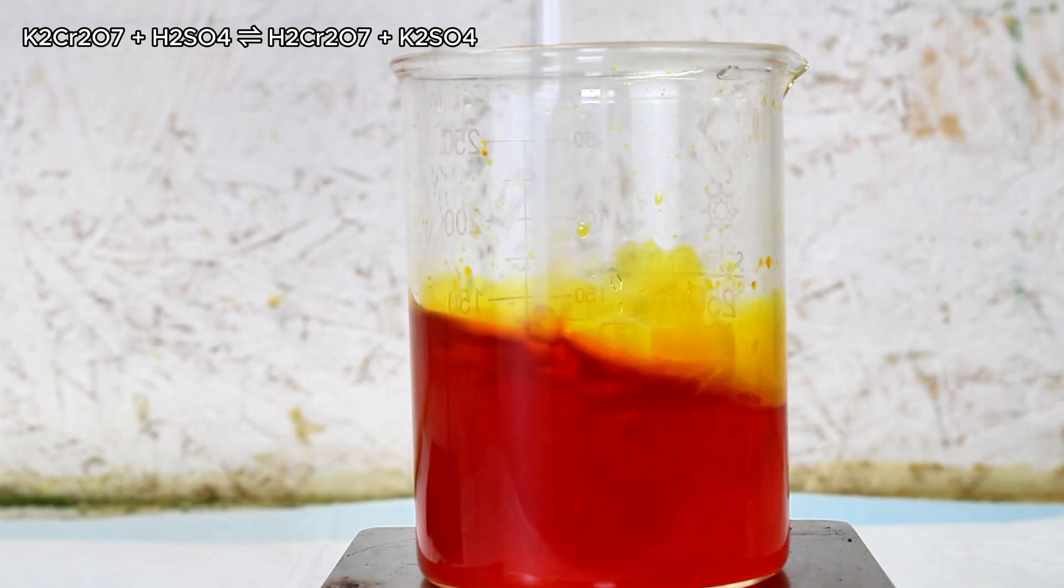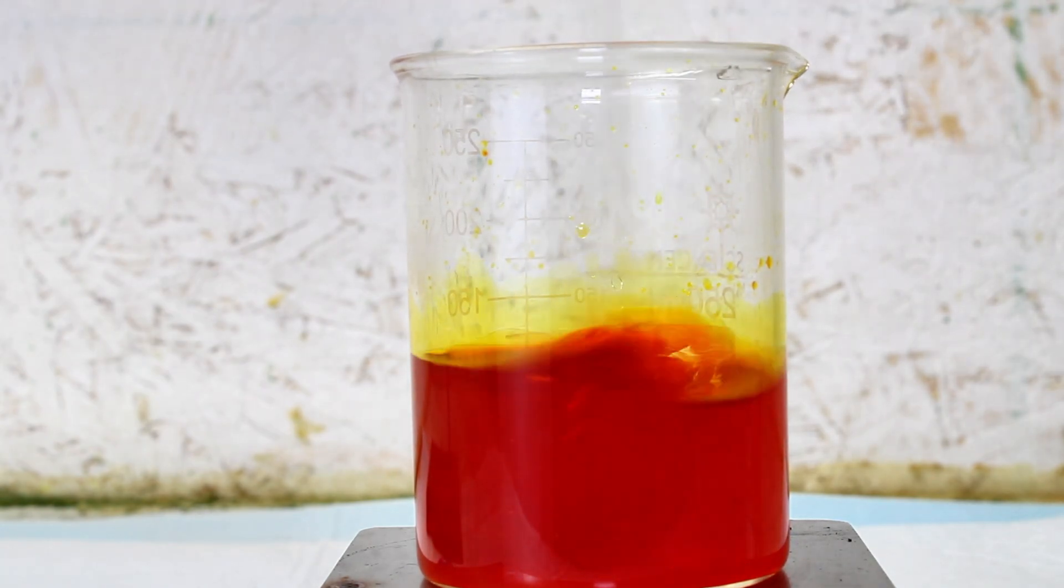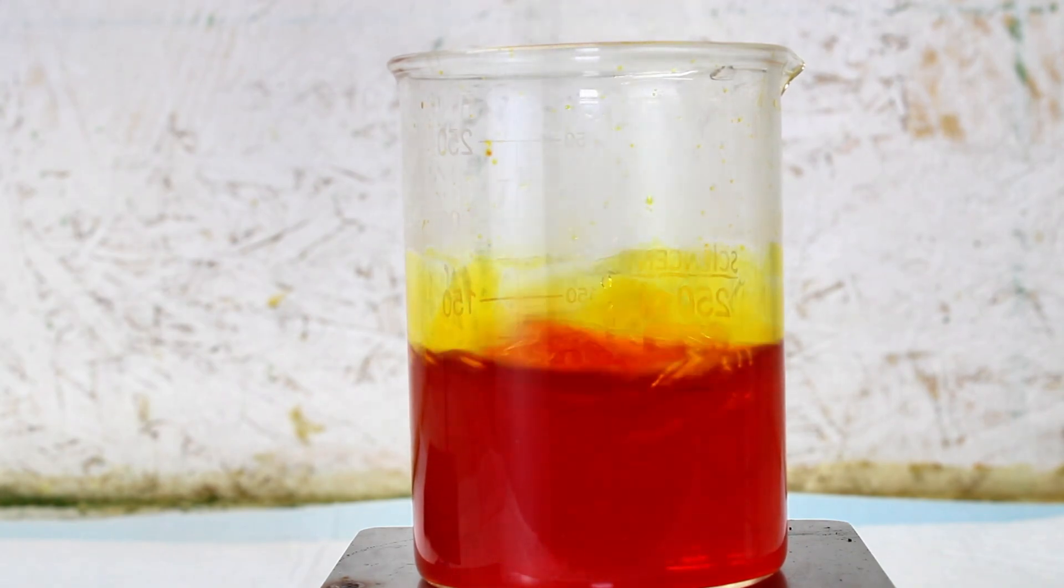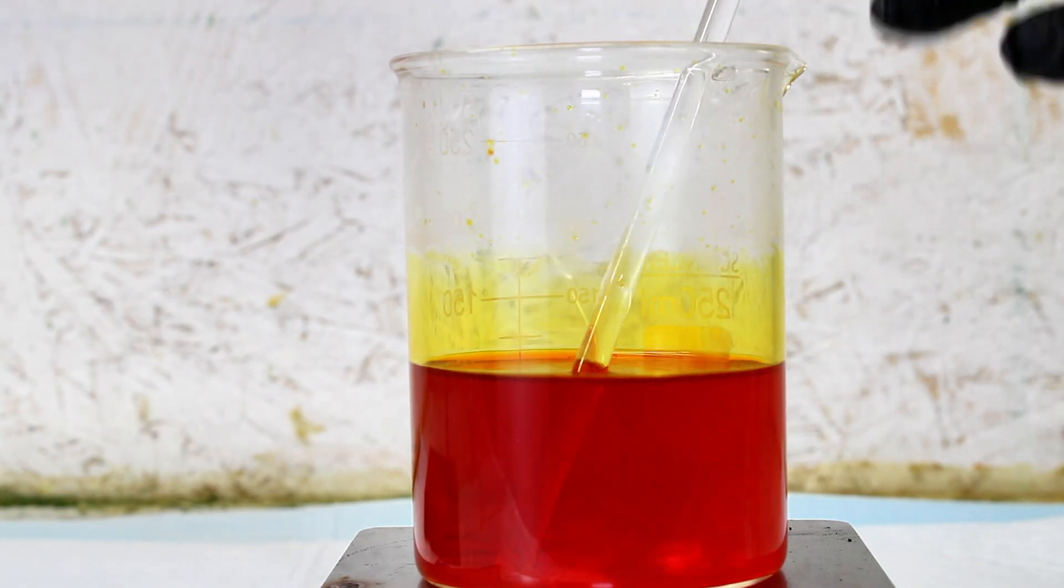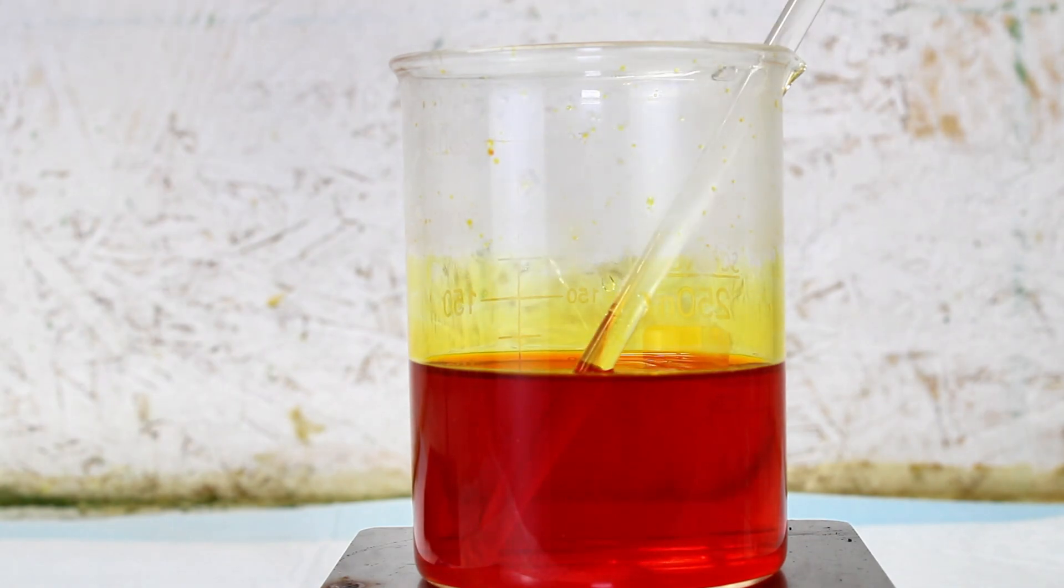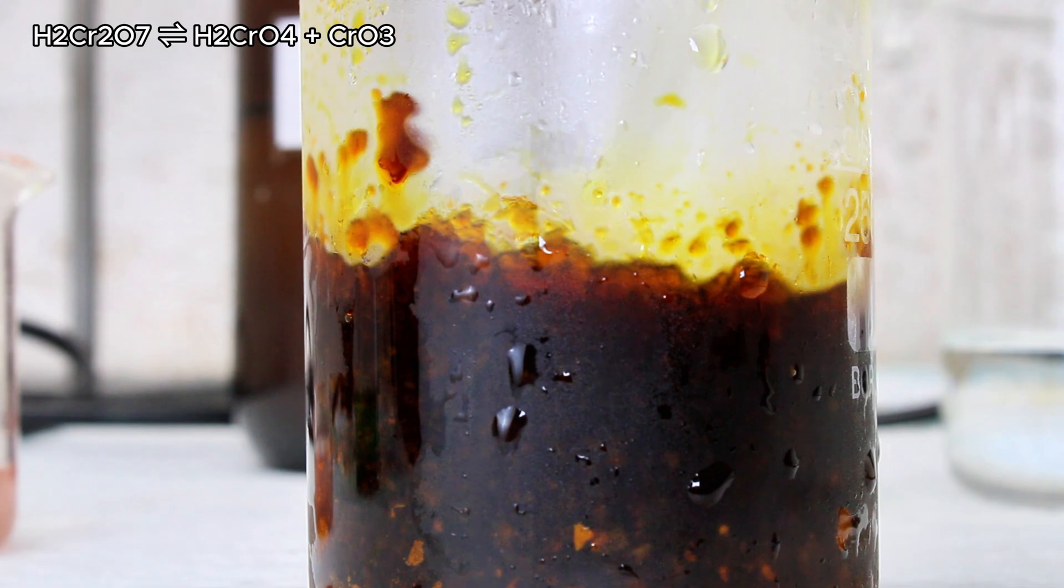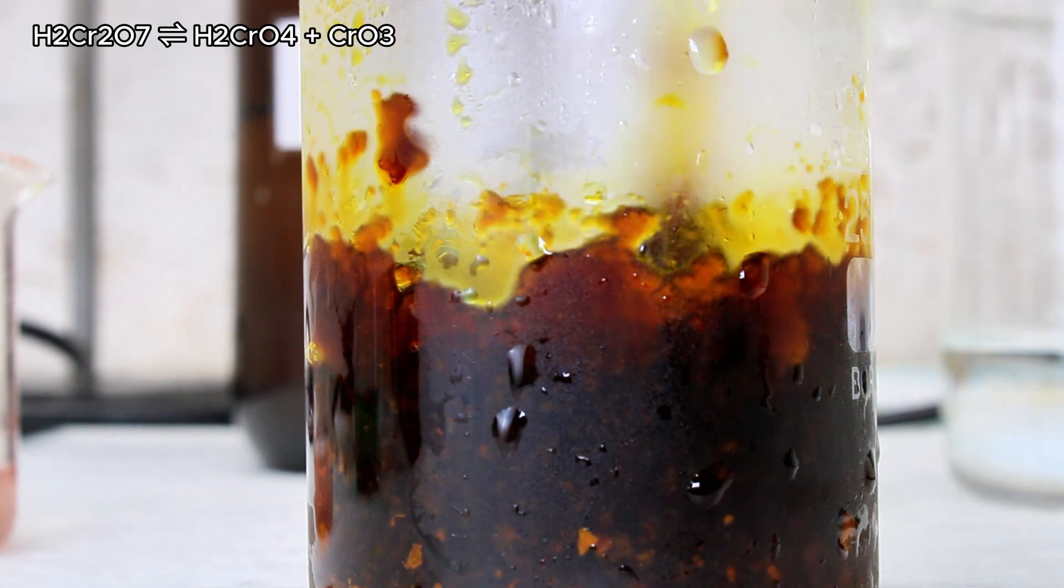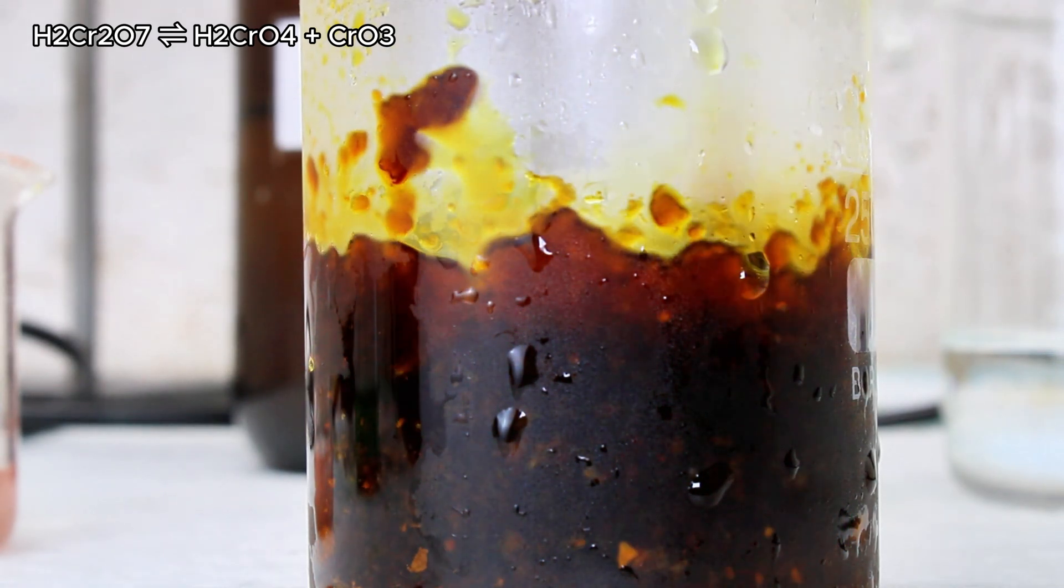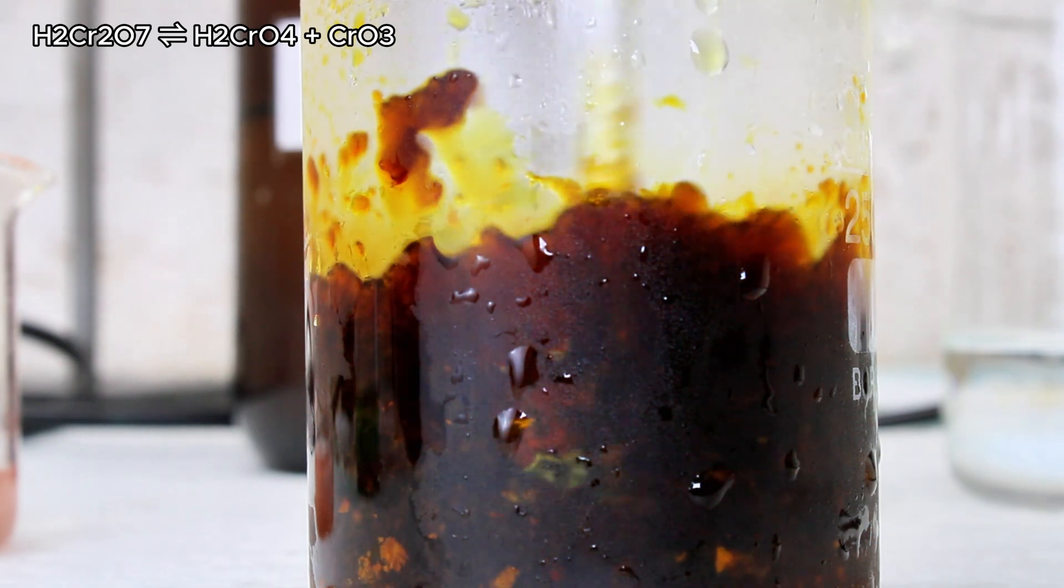This forms the horrifying chemical chromic acid, which is a blood red color and used extensively in chrome plating, much to the misfortune of the chrome plating workers. If you leave this sitting around long enough, eventually an extremely dark red and almost black solid will precipitate out. And that is chromium trioxide.